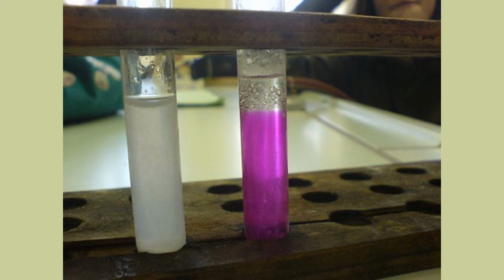During the titration, an indicator is used to signal the equivalence point. An indicator is a substance that changes color when the pH of the solution changes. For example, phenolphthalein is a commonly used indicator in acid-base titrations. It is colorless in acidic solutions and pink in basic solutions.